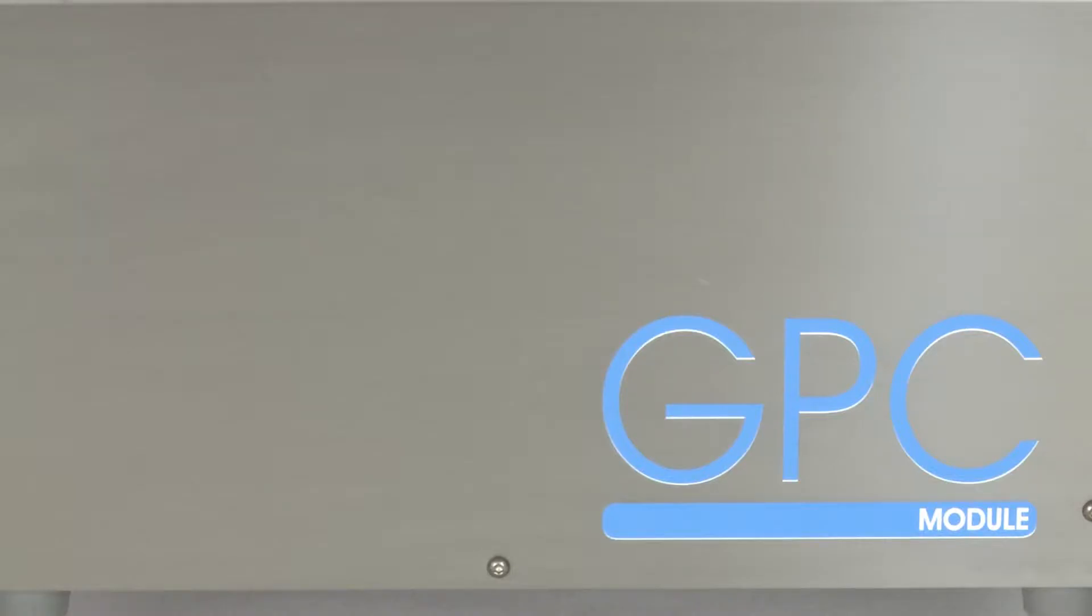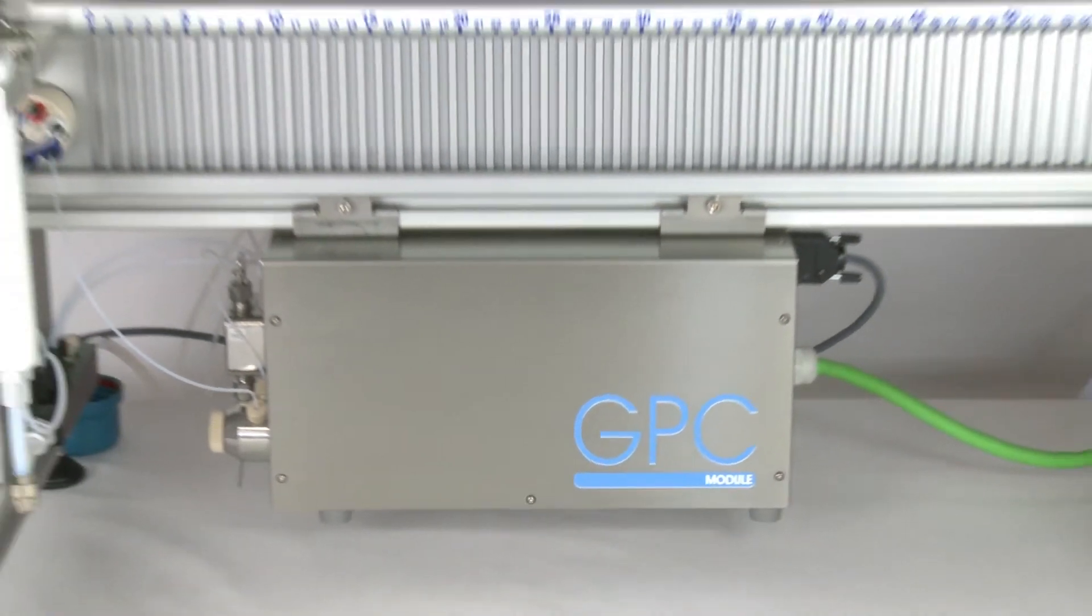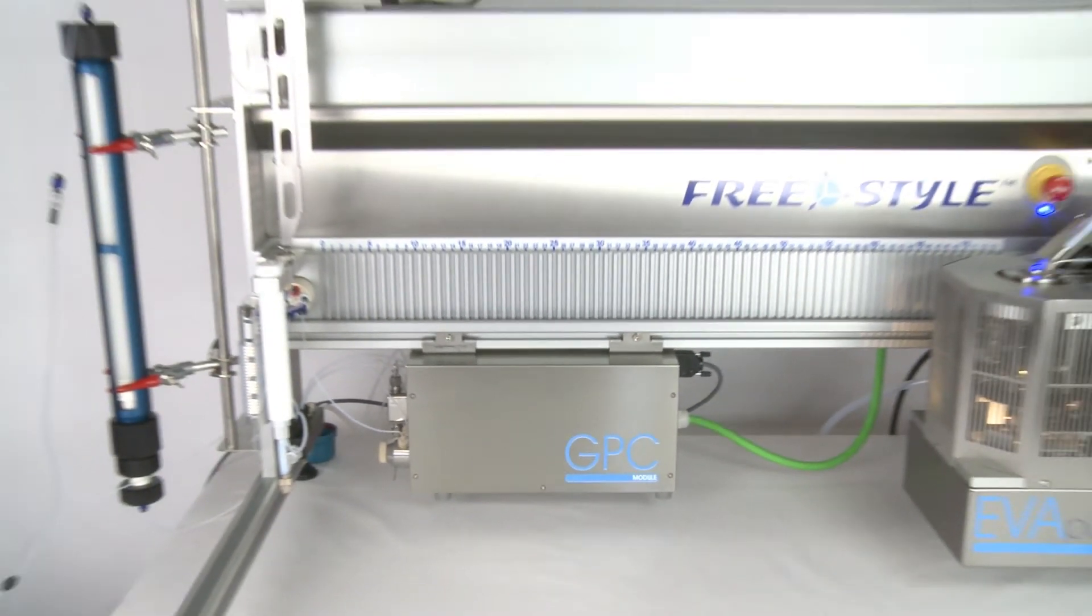Even the deceptively simple GPC device, through its features, can improve the quality of your results and relieve your workload.